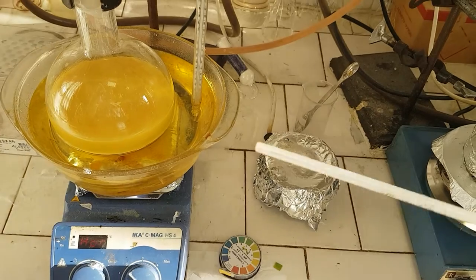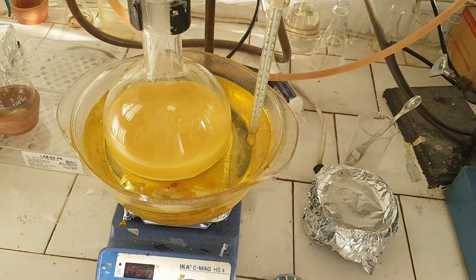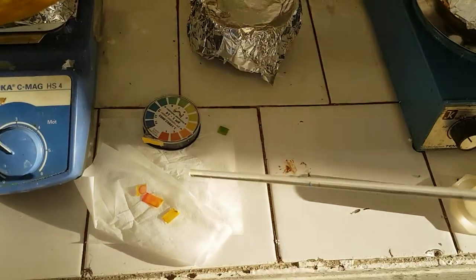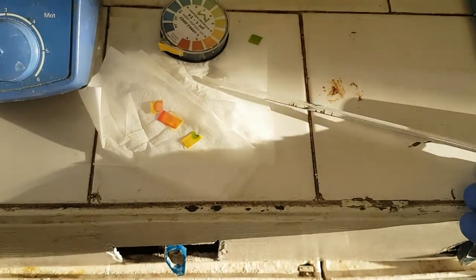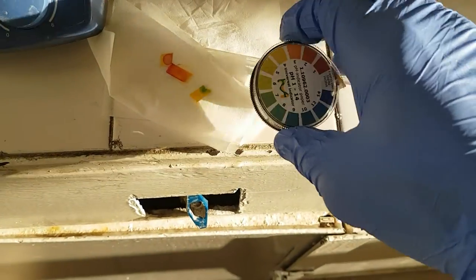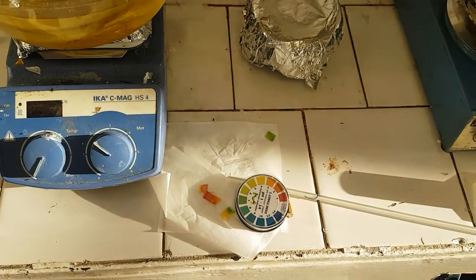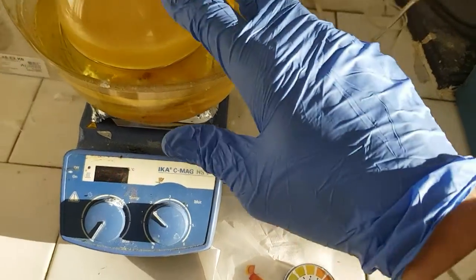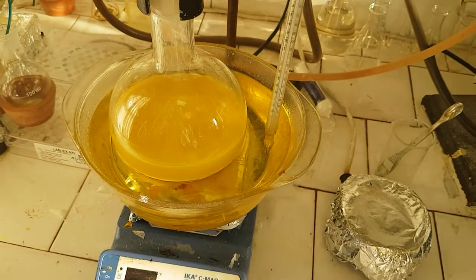And now we will check. Yes — the reaction is complete, we have neutralized all the acids in our mixture.